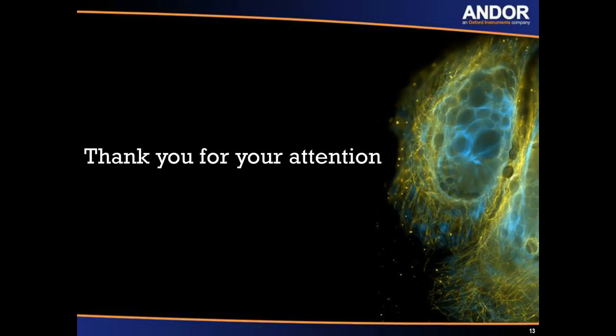I'm going to read it all. Let me know if you need me to read it over. No, I can just wondering. They're saying, just wondering if I can apply the light sheet scanning mode in NEO by only using one half of the full camera detector. Will there likely be any software or firmware upgrade for NEO to enable light sheet slit detection scanning mode for NEO?